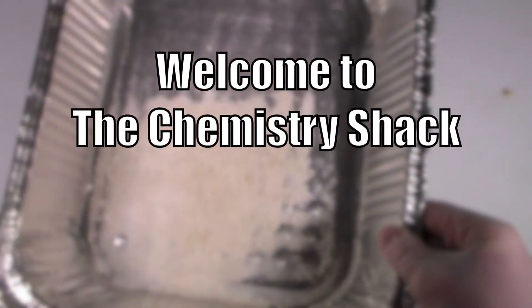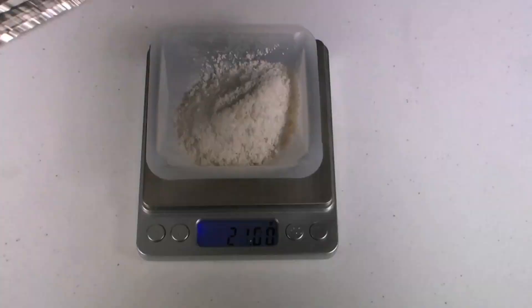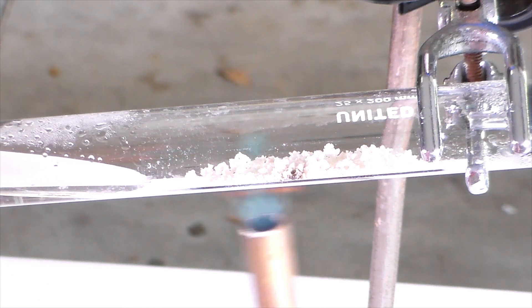Hey guys and welcome to the Chemistry Shack. In a previous video, I made aluminum oxide. In this video, we will be using that aluminum oxide to dehydrate ethanol in order to make ethene gas.